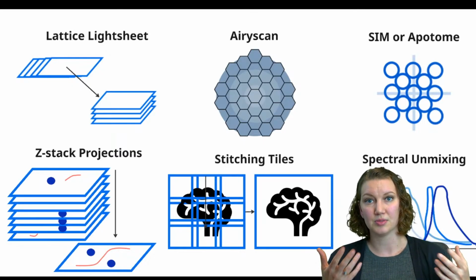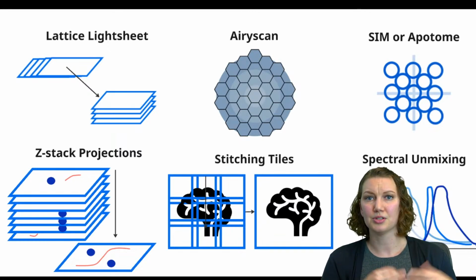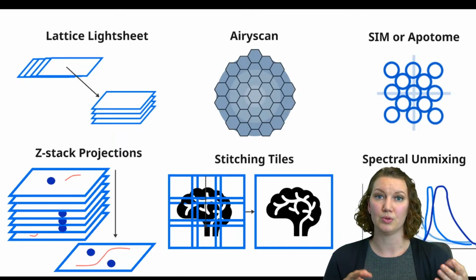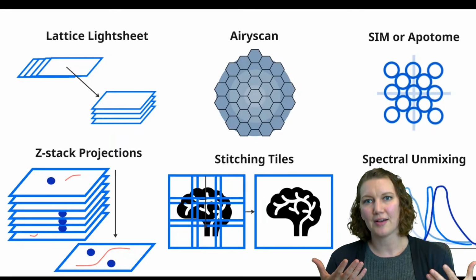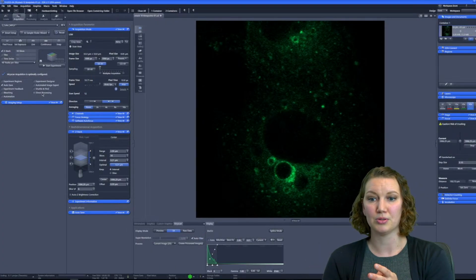So what we're going to look at are some cells that are expressing Rab4, an endosome marker, with emerald, so in green. And I'm actually using a mode that we call multiplexing, where you can scan 8 lines at a time, right? Normally on a point scanner system, a confocal system, you're scanning 1 point at a time. Here we're scanning 8 points at a time. You have to post-process that raw data to look at the final result. It makes us able to image really dynamic live cell processes, but we have to add that post-processing step.